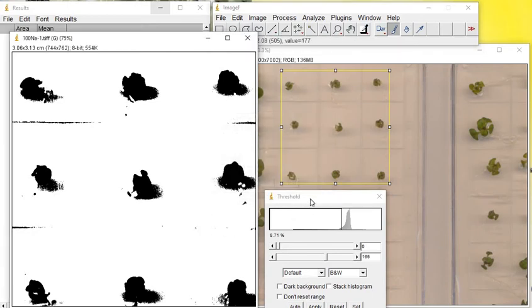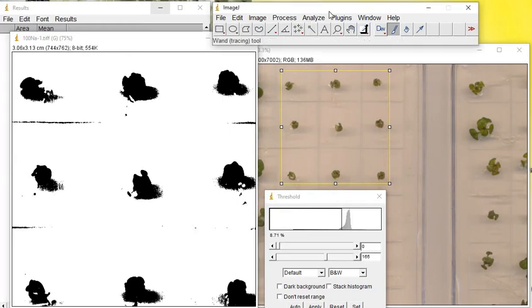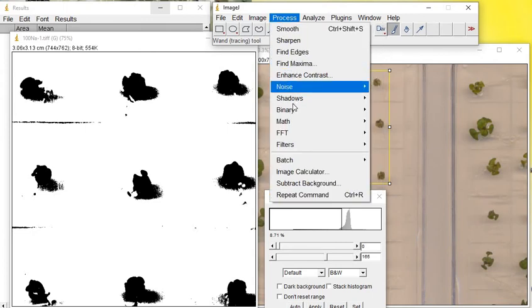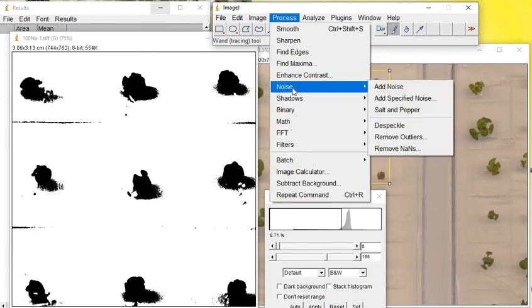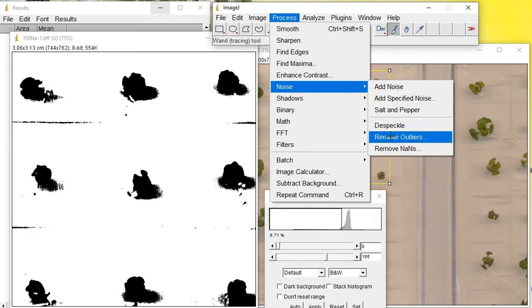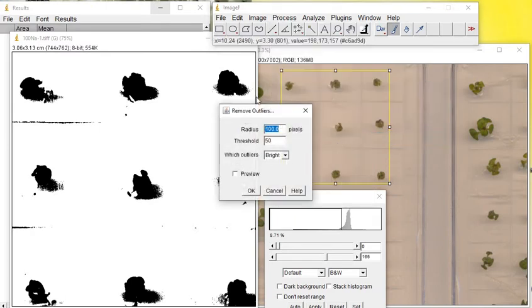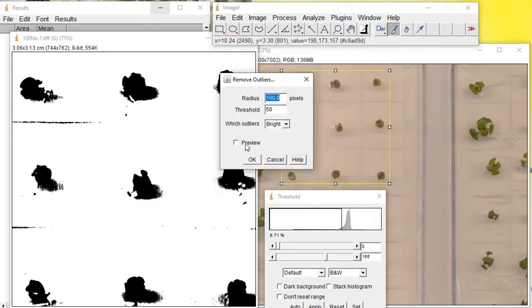The other thing is when you go to Analyze and Process, there is a function called Noise, then Remove Outliers. Let's see what will happen here.